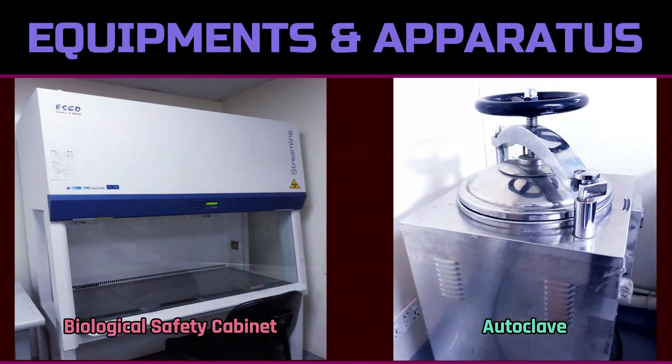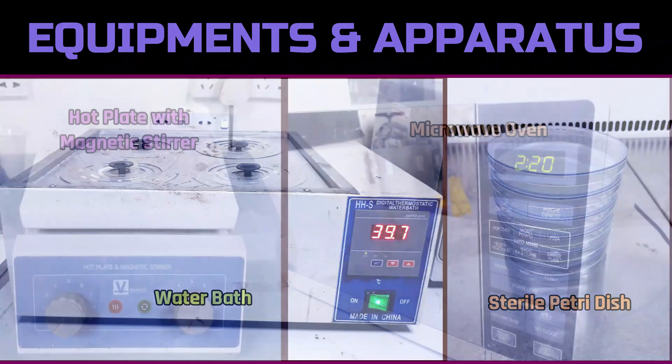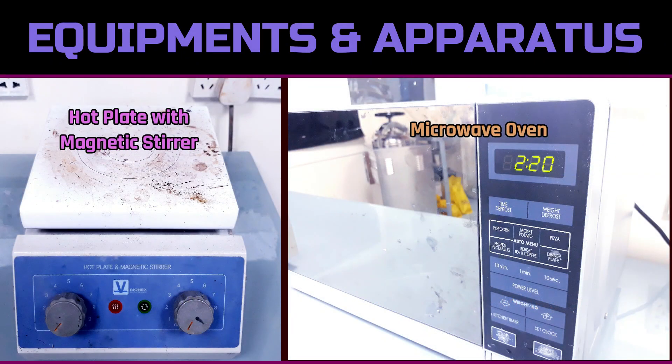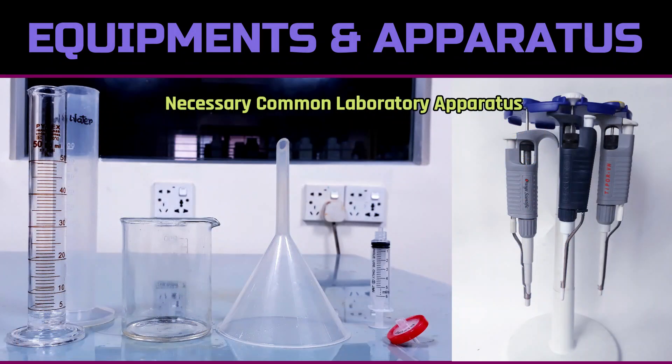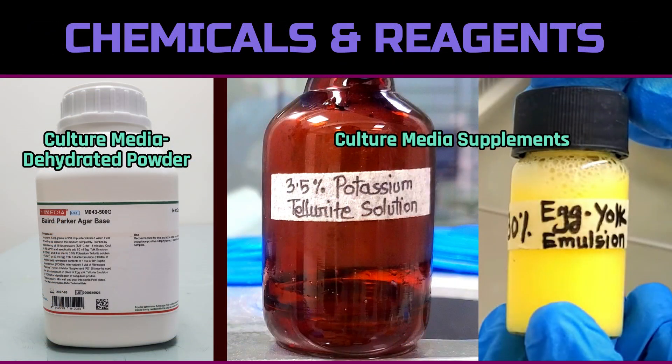For the preparation of culture media, we need a biological safety cabinet, autoclave, electronic balance, pH meter, water bath, sterile petri dish, hot plate with magnetic stirrer, microwave oven, common laboratory apparatus and glassware, ready culture medium powder, and necessary supplements.